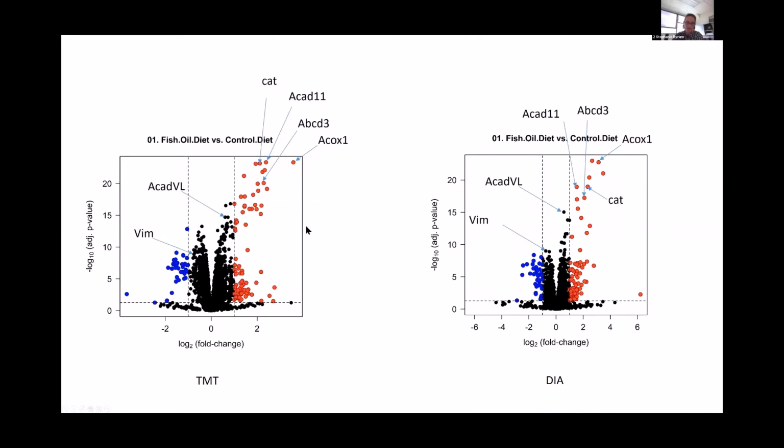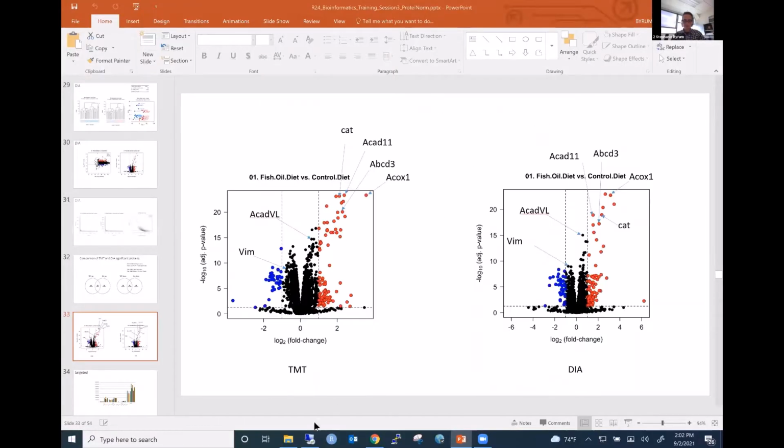There's not that much difference on this level of proteins. It's the ones that we've identified that you're missing in the DIA that we don't have here. And some of these that are flagged as significant, I think could actually just be due to the missing value problem. So this is where, let's see if I can bring it up.